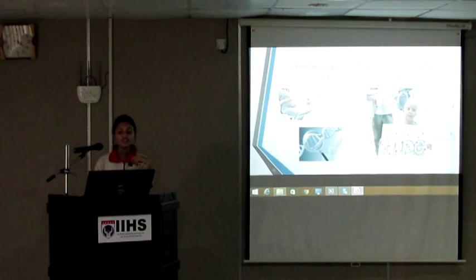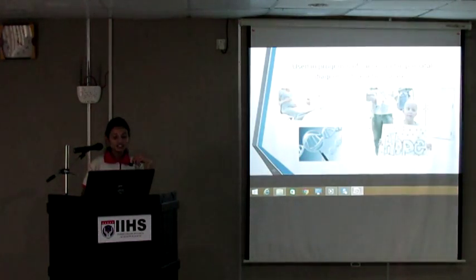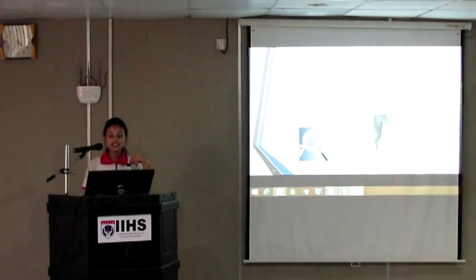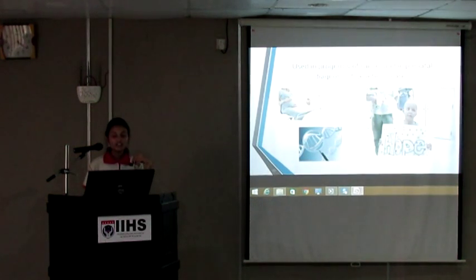The recognition of the basic role of mutation in the genesis of cancer requires the identification of unique genetic changes associated with the particular tumor. Here, southern blotting is used, and the prenatal diagnostic testing involves test the fetus before birth to determine whether the fetus has certain abnormalities, including certain hereditary and spontaneous genetic disorders.